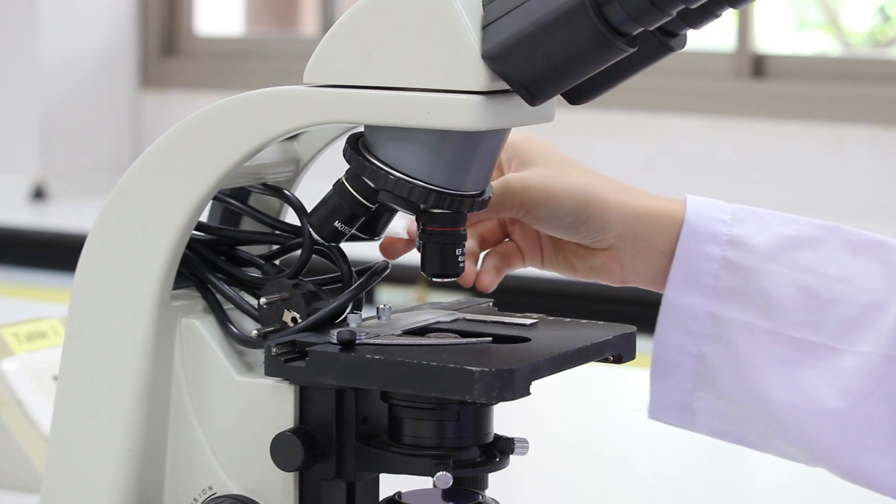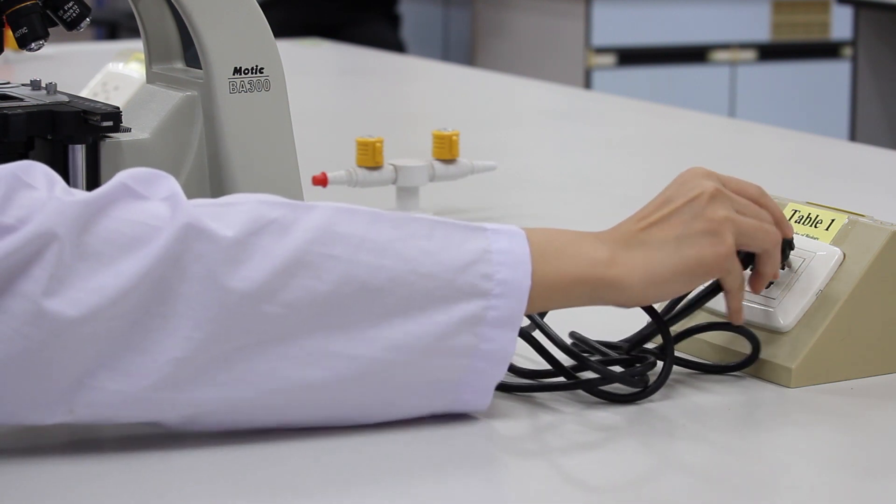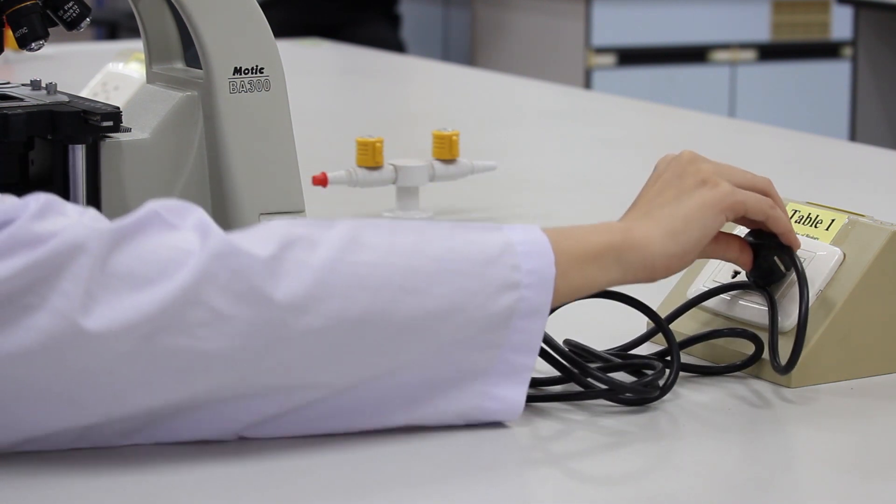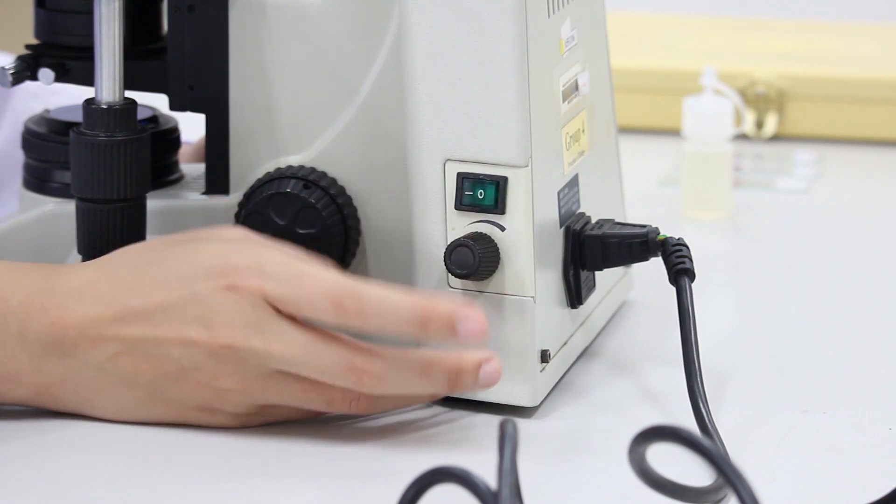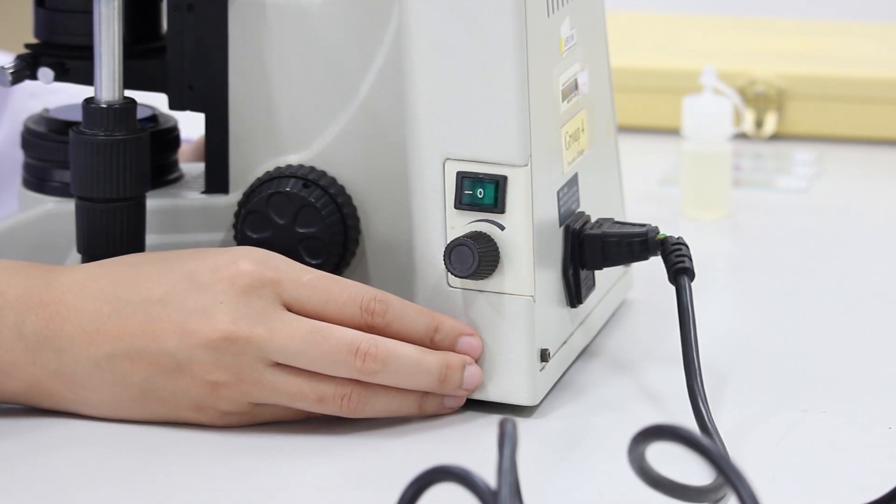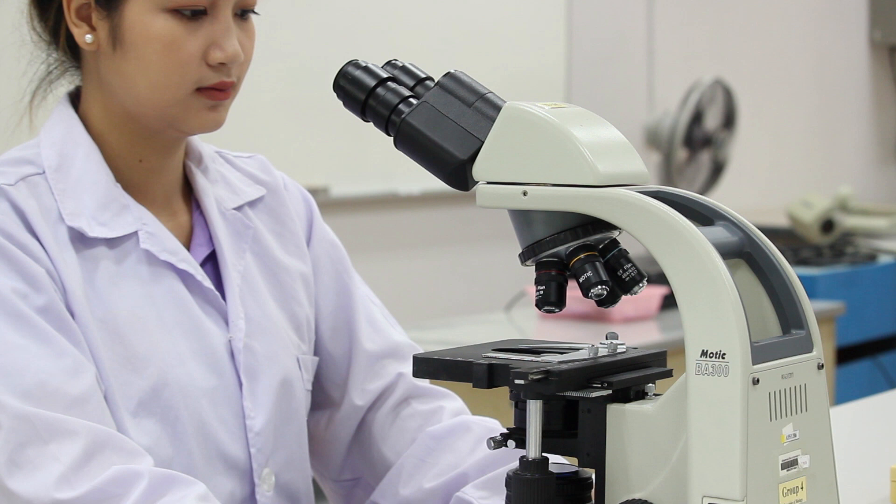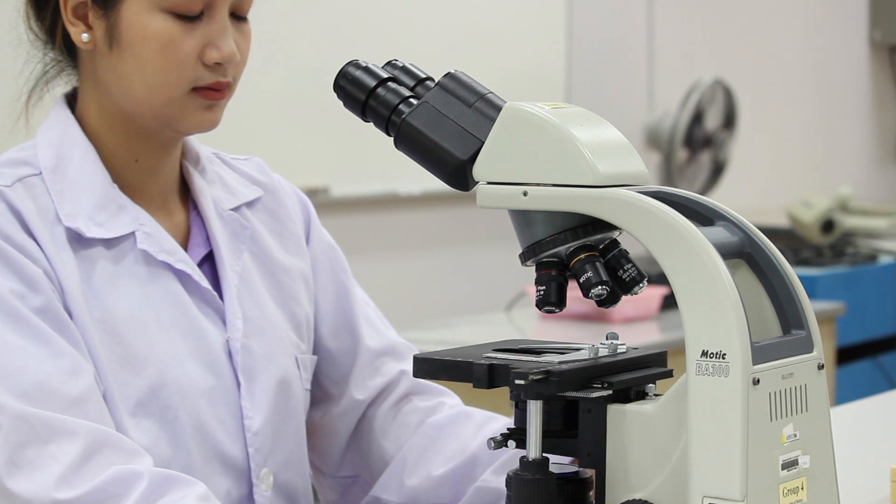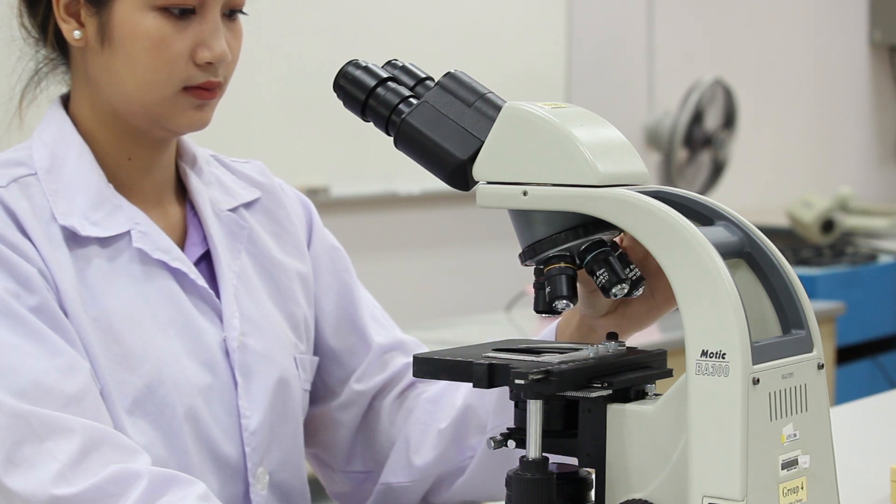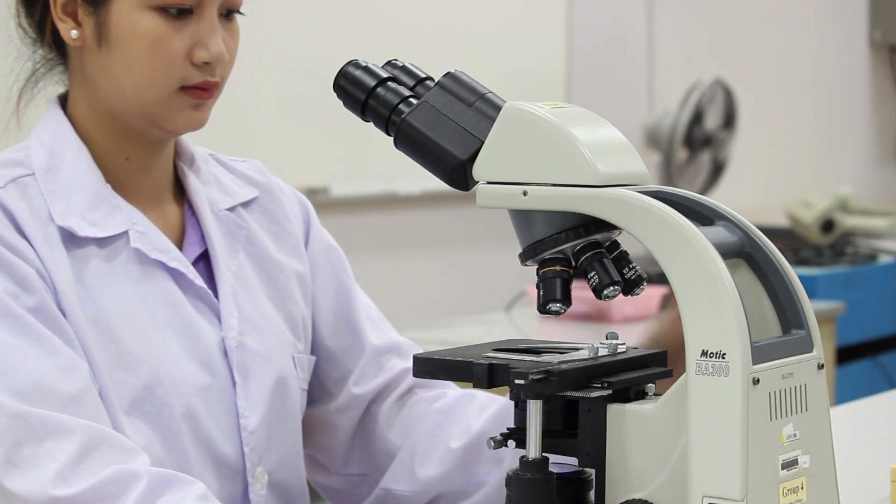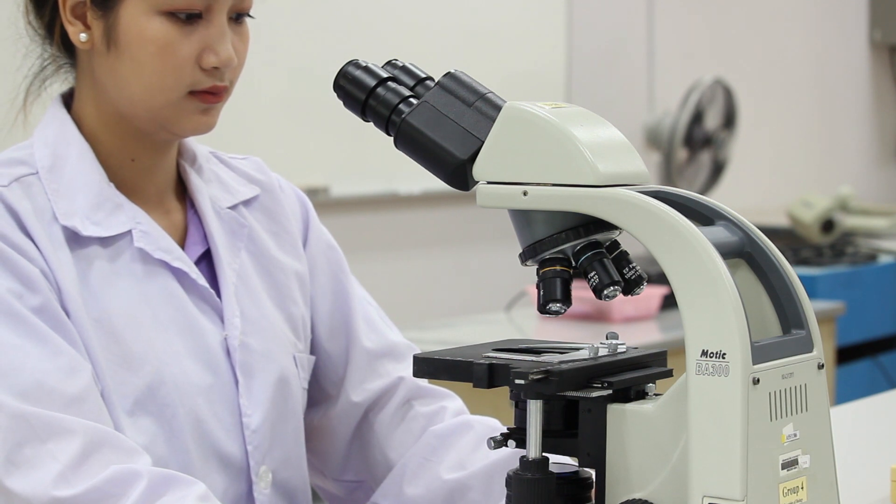Next, plug in the microscope and turn on the light source and increase the light intensity. If it is not already in position, rotate the nose piece until the lowest power 4x objective is aligned with the body tube.